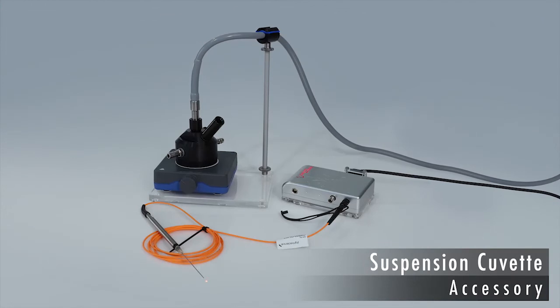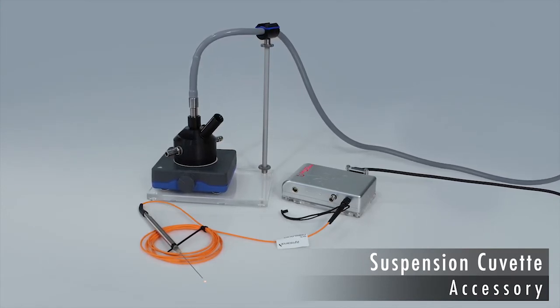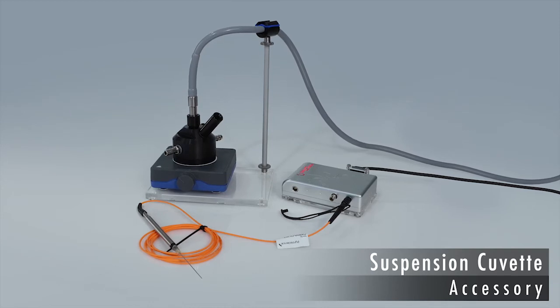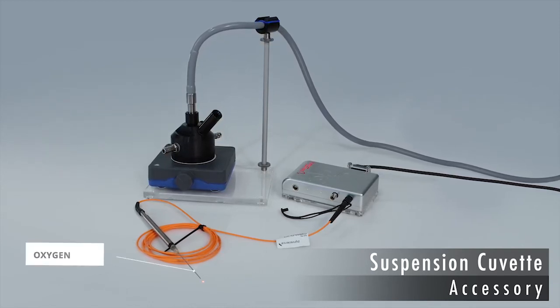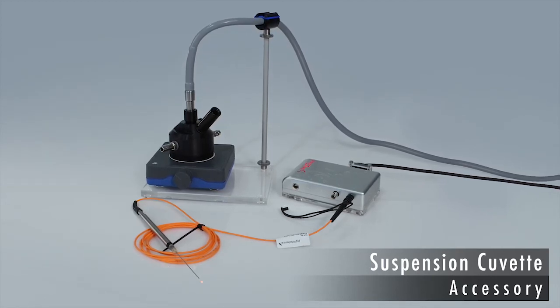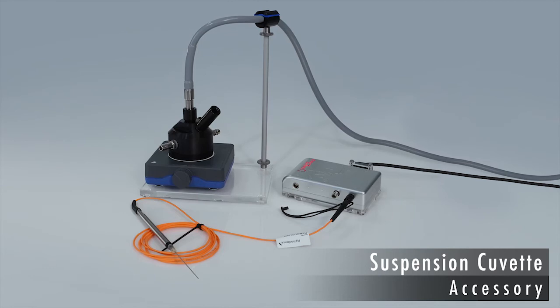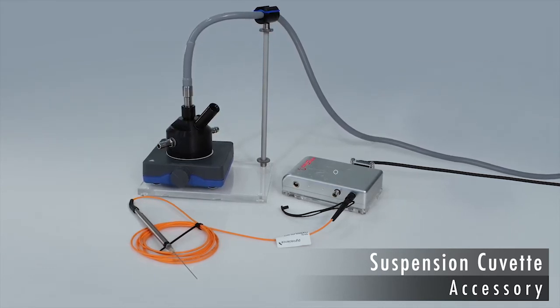The KS2500 Q-ET enables the simultaneous analysis of photosynthesis by fluorescence and oxygen measurements. The needle-type oxygen sensor is inserted into the side port of the cuvette. The oxygen signal is acquired by the oxygen meter, which is linked to the mini-PAM 2 by a special adapter.